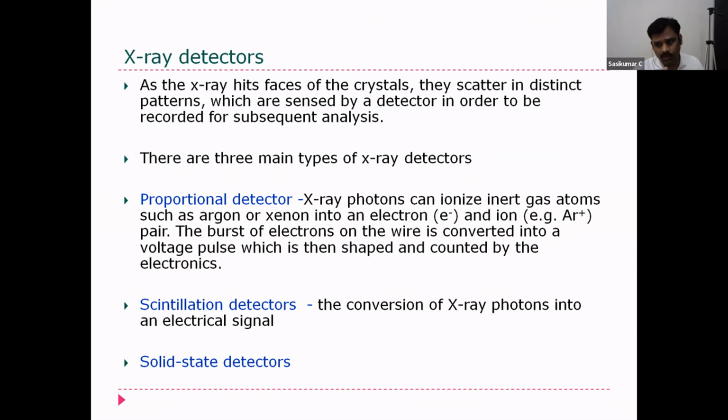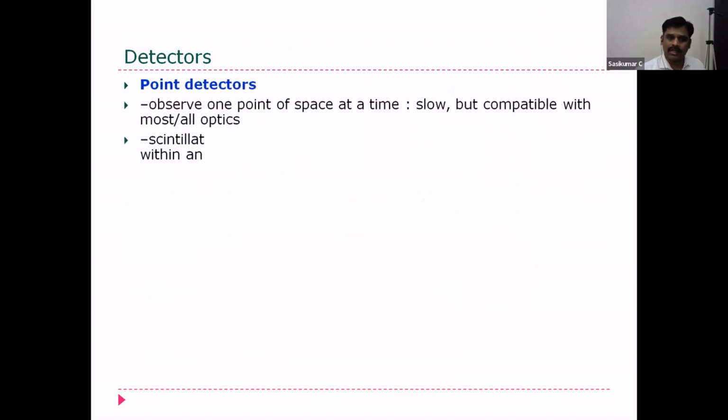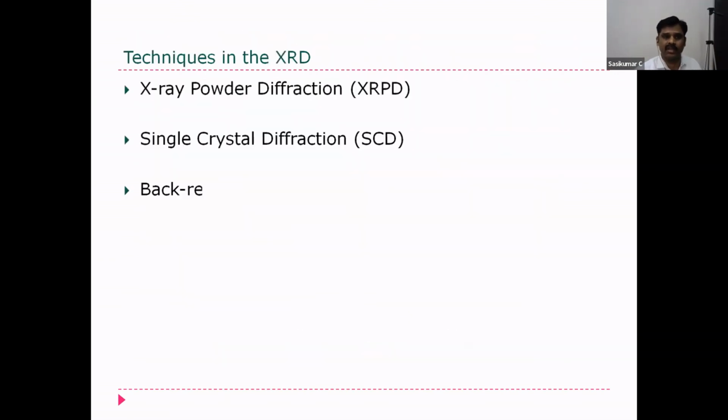And in case of a line detector, it has 160 silicon chips, and all will be detecting parallelly. So by this way, your accuracy will be much better, and you can process the material rapidly. And in case of an area detector, you get much more accuracy. So here are some latest detectors where 2-dimensional area detectors are available, so you can get a very clear signal. There are some signals which will be missed by a point detector, whereas a line detector will give you better accuracy.